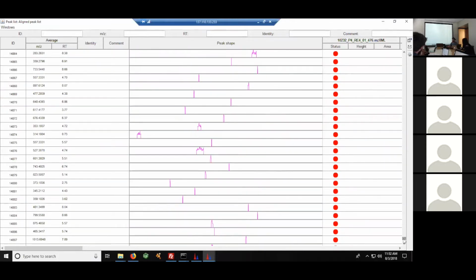Also, what we want to filter out right now are things which did not trigger MS2s. We're aware that this means you will subsample your data set, but it reduces the massive amount of information to the most high quality signals, where we have MS2, which we need for our molecular networking and database dereplication.